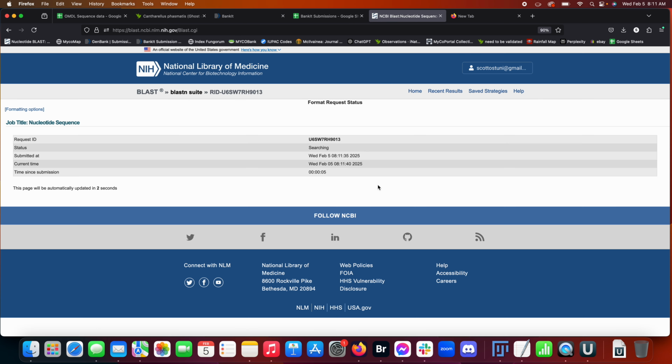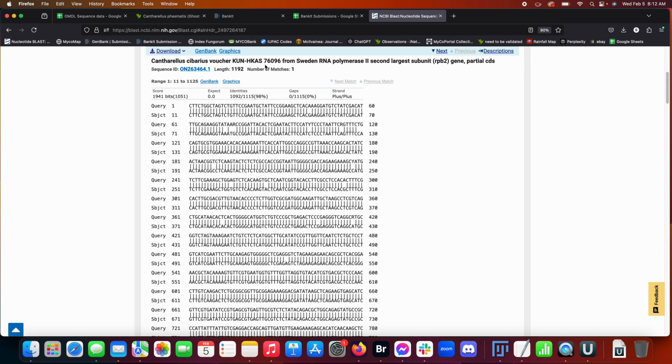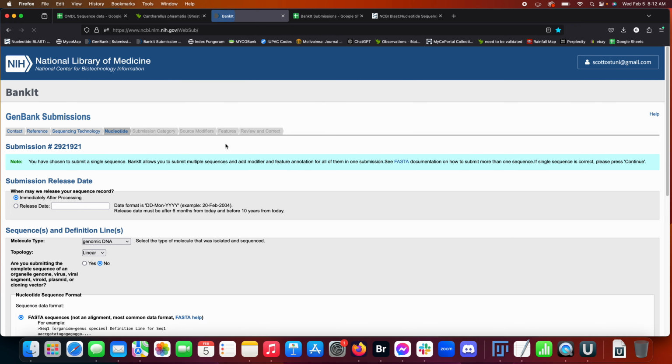I'm going to make sure that's in the right direction. Okay, cool. Hit continue.